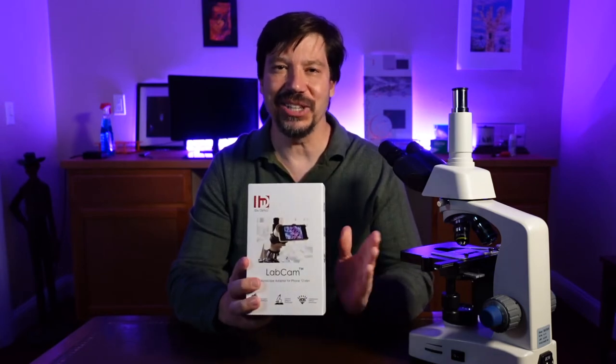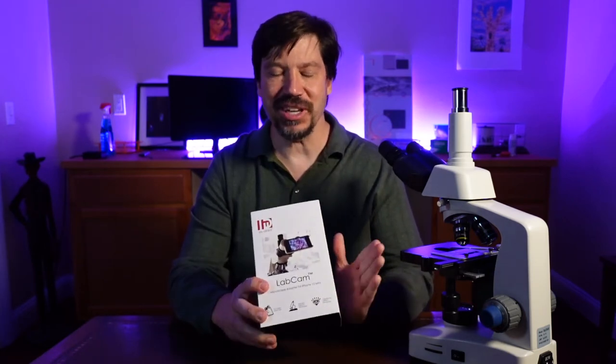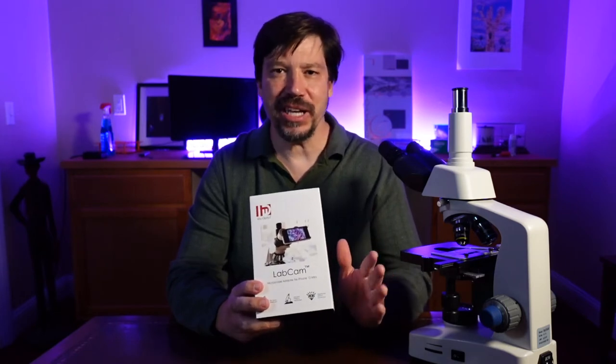Well, this is not a cheap item. It costs $259 and I'd really like you to take a look at this. So one of you will be getting a $100 credit for the purchase of one of these LabCams. Pay attention to the video — I'll show you how to enter the contest and one of you will get $100 off the purchase. We'll see what's in the box, how to set it up, and how easy it is to take these high quality images.